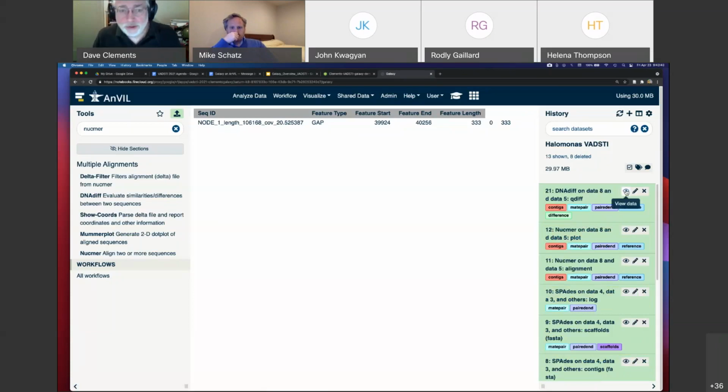Now we need to get this into something. Yeah, we need to use this information to extract the DNA. We're going to use bed tools to do that. And to use bed tools, that's another suite like Mummer, which is a lot of tools. They operate on bed files. We need to convert this information into bed format. And we're going to convert it into a 3-column bed file.